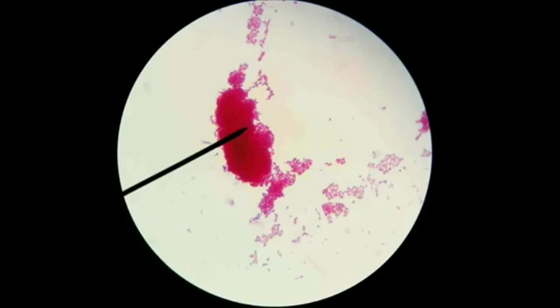On the left side is my positive control, my acid-fast organism. I have used Mycobacterium as a known acid-fast. You can see how I don't have a nice smooth circle of color. The color is clumped on the slide, and that's because the bacteria, again, are waxy and they stick together. Under the scope, they're going to be hot pink, and again, you'll find them in clumps.